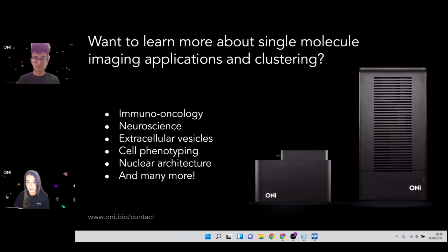Great. Next question is, what are the units of the distance tool? And Haraman, it looks like they asked this question when you were doing the DB scan clustering. Right, so the units of that distance tool are not trivial to explain right now. I would say that there is a lot of literature about DB scan and HDB scan on the internet which explains this, and I'd be happy to discuss it offline in more detail.